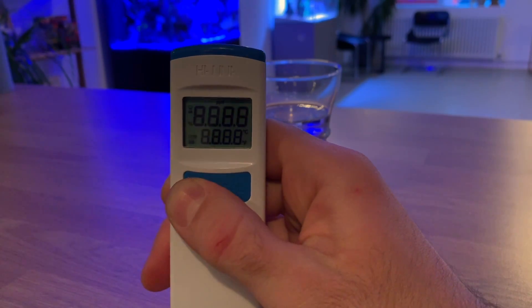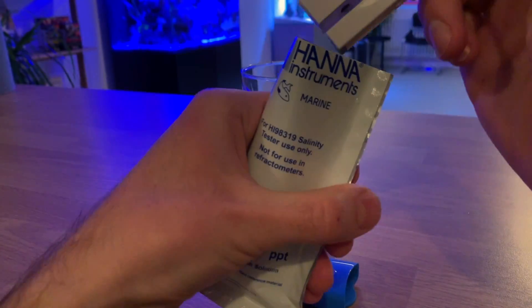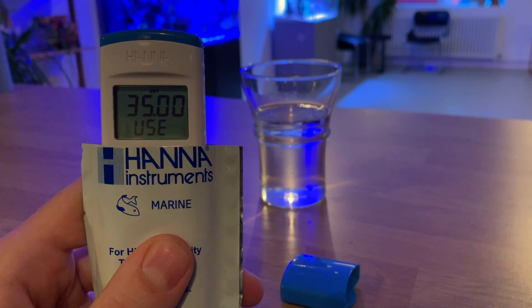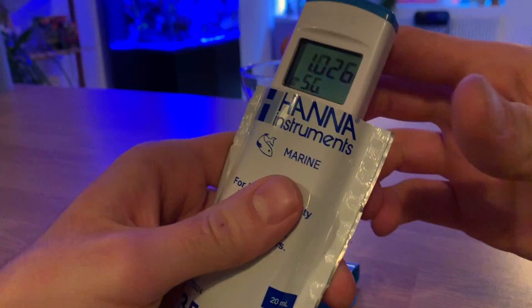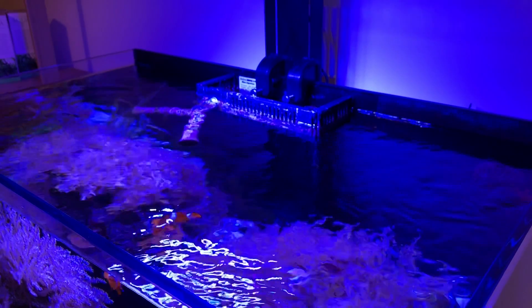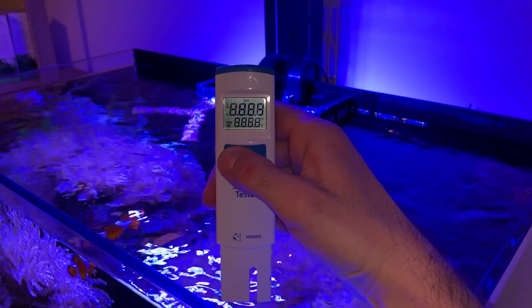To calibrate, simply dip the unit into the calibration solution and wait until 'store' is shown on the LCD screen. At that point, the calibration is complete.